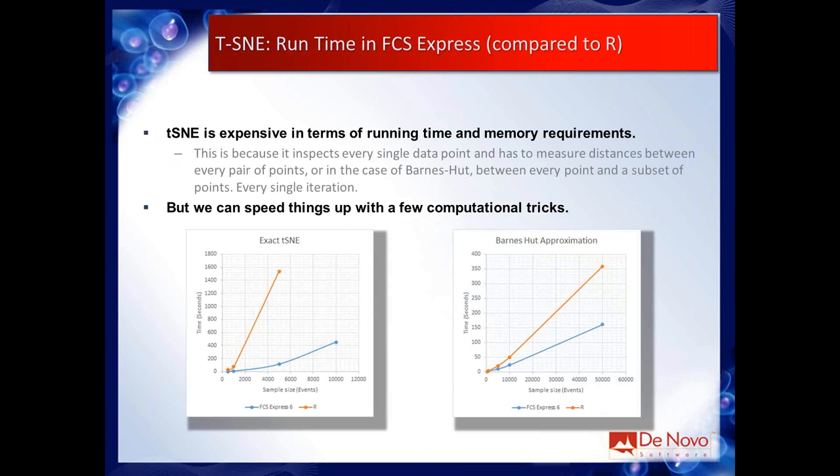So for 50,000 samples, if you're running it on a reasonably fast computer with 4 cores, I didn't ask Andrea actually what kind of computer he ran this on, but it's reasonable to say you can probably run up to like 100,000, 500,000 without any major problems. Once you start getting past there, it starts taking a really long time.